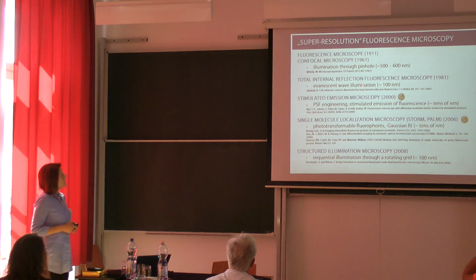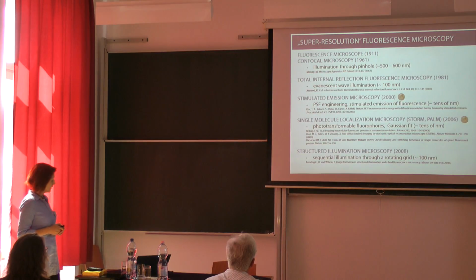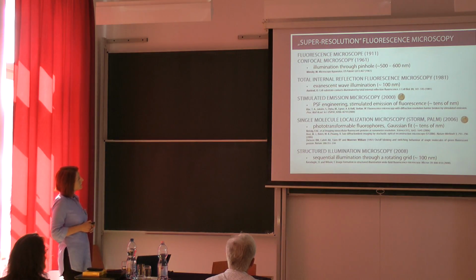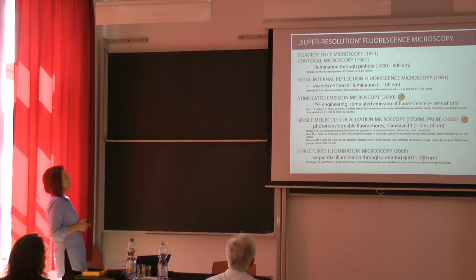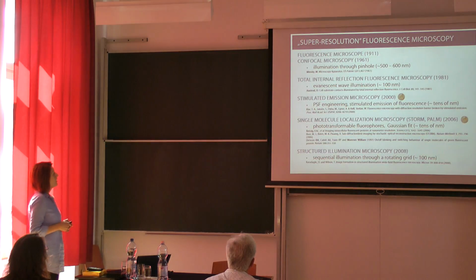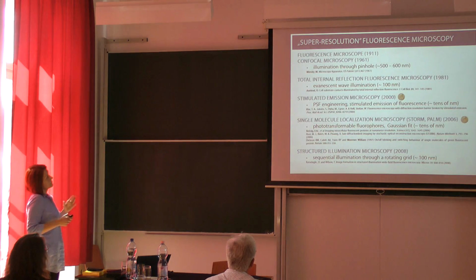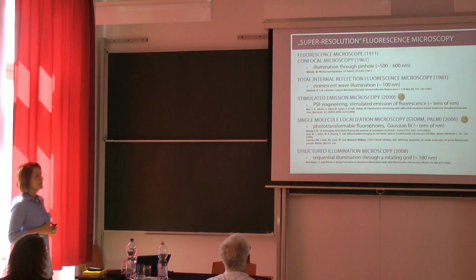The second one was total internal reflection fluorescence microscopy, where the phenomenon was combined with fluorescence in 1981. After that, in 2000, stimulated emission depletion microscopy was introduced by Stefan Hell. We can call it a point spread function engineering technique.